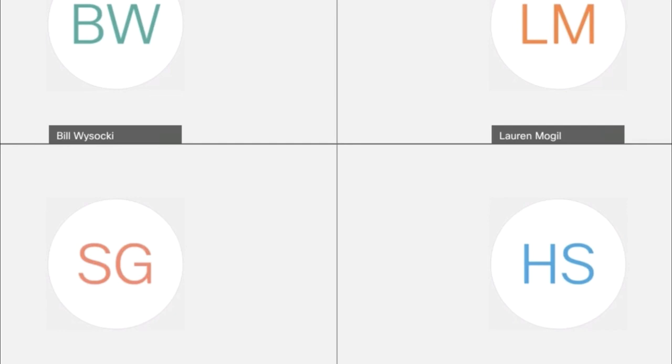So if there's a cell type marker that you know of that could indicate which cell type a specific cluster is, that's another way you can do that, but it might take a little bit of a lift.